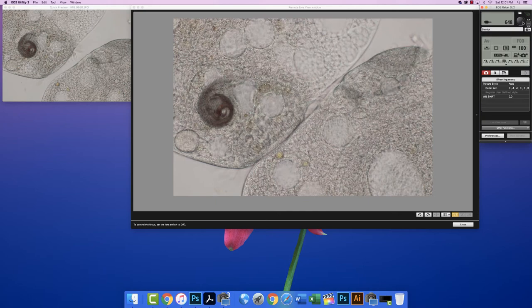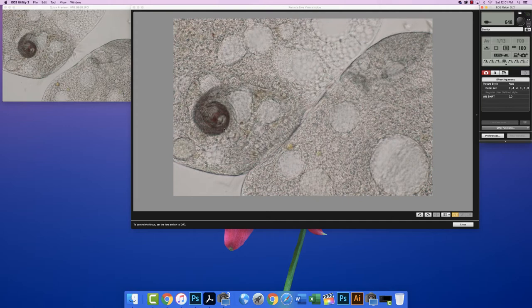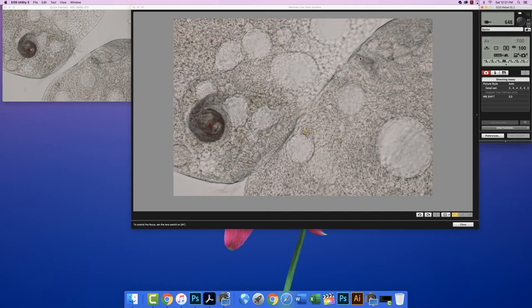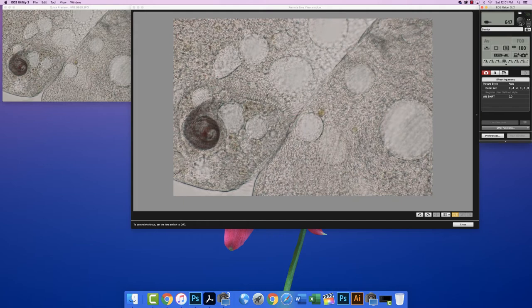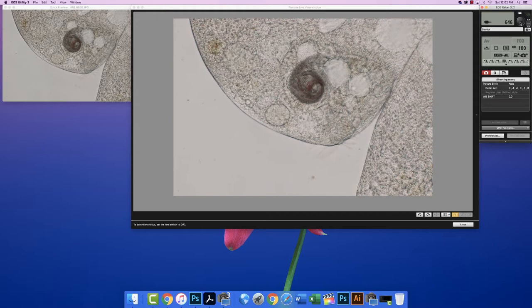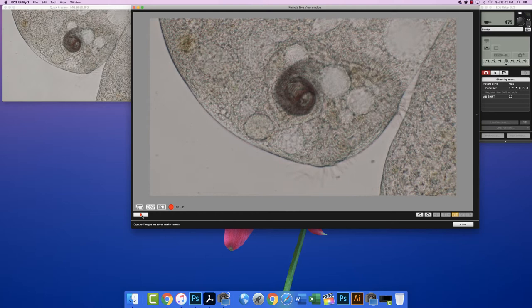See, if I focus on one part, I'm trying to focus on this region right here. It's a little tough. Maybe there. Then other parts, like this part over here, looks out of focus. And let's take a little movie of this. You also see the movie icon up here, the movie camera icon. And I'll press start, and then I'm going to try to focus a little bit.